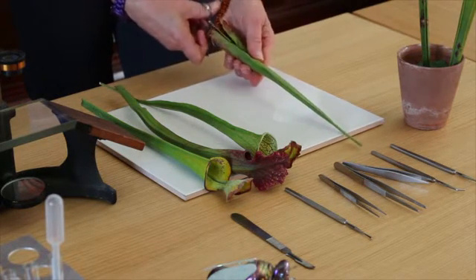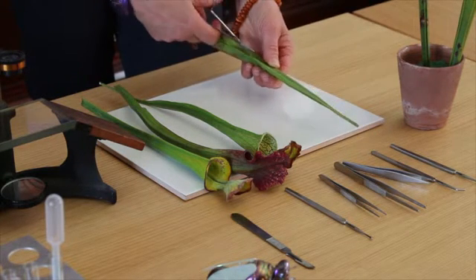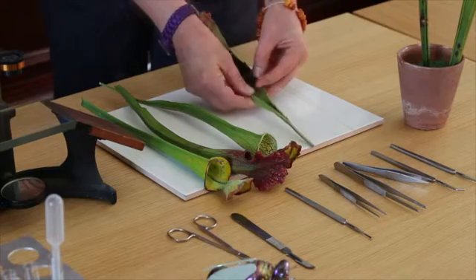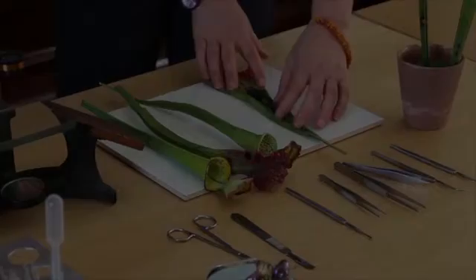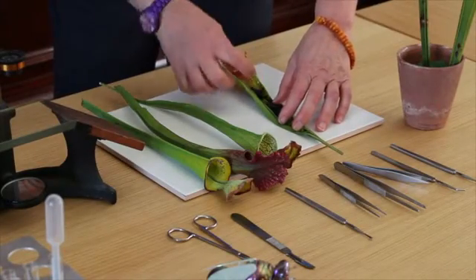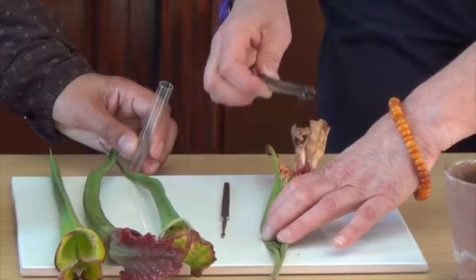These traps have gone through a summer of flies. So as I open this up, it looks pretty disgusting. I'm now going to take some of these parts of bodies — I'm going to scoop up some of these.